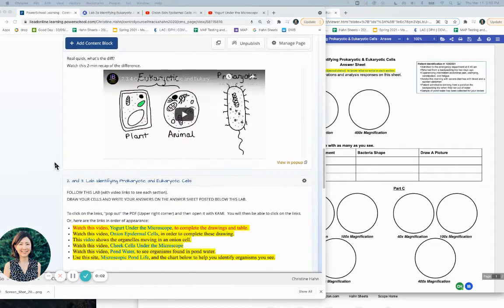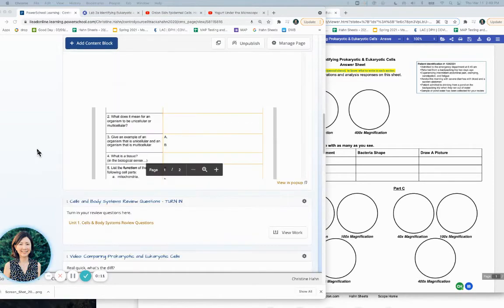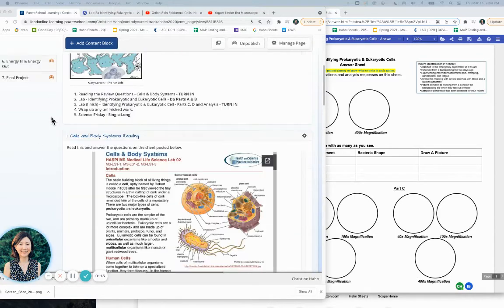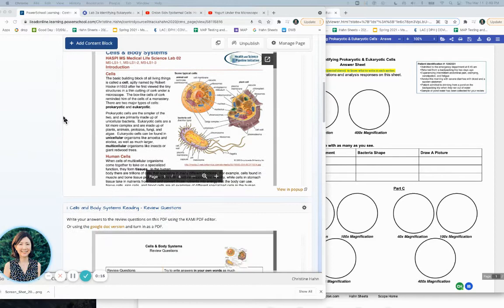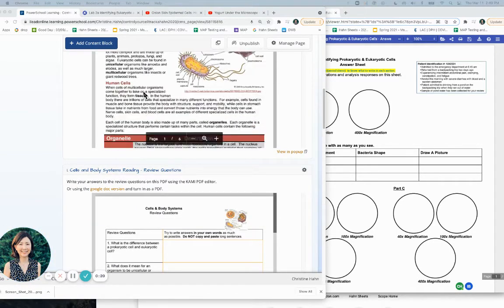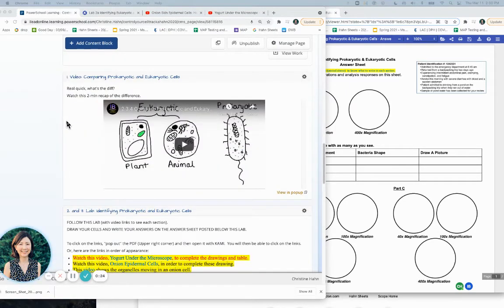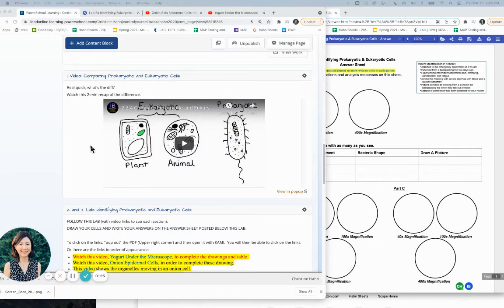I'm going to be explaining how to do the identifying prokaryotic and eukaryotic cells lab. Hopefully you already did the review questions, so you have an idea what the differences between prokaryotic and eukaryotic cells are. Got a little intro to some of the organelles inside, and also watch this quick recap.